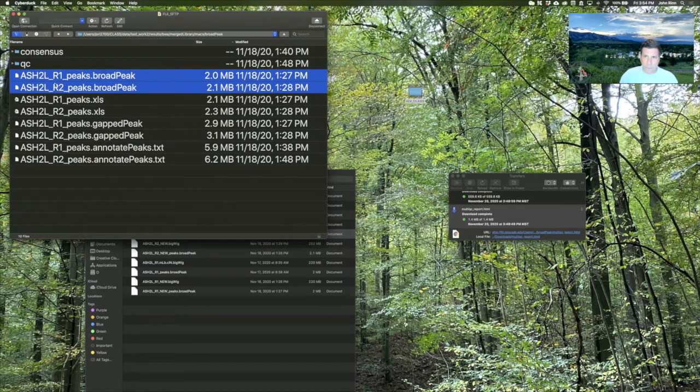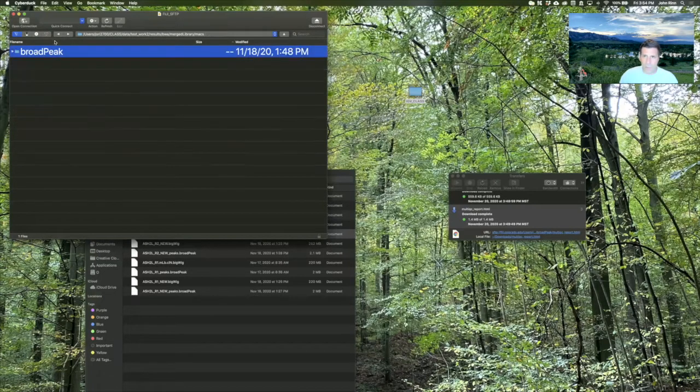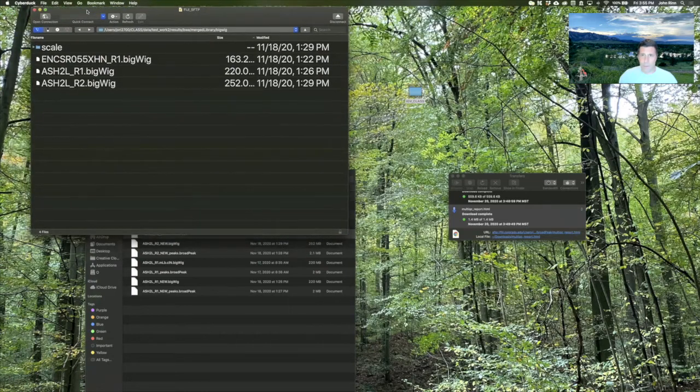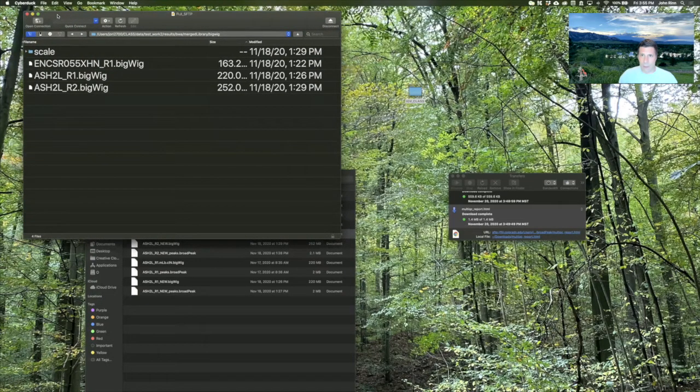So gather up these two, and then in the bigwig folder, gather up these three bigwigs, and we'll take a look at them. And just for fun, what I did is run these same samples that we just ran together on two different versions of the nf-core ChIP-seq pipeline. So we can compare to see how the bigwigs and the peak calls would look different if you ran it a year and a half later, which is what we just did since the last class. And I'll leave you in suspense of that. So for now, what I'll do is introduce you to IGV.